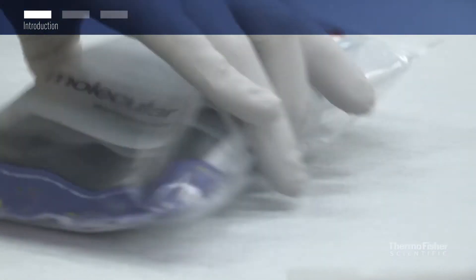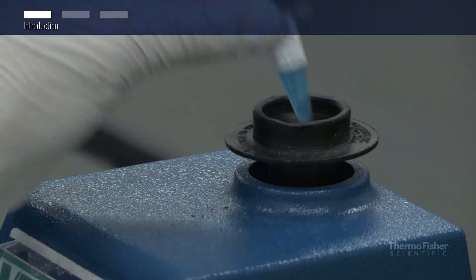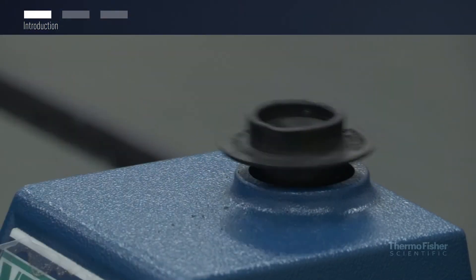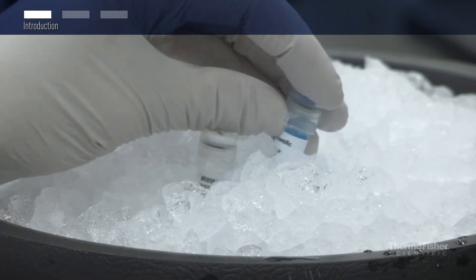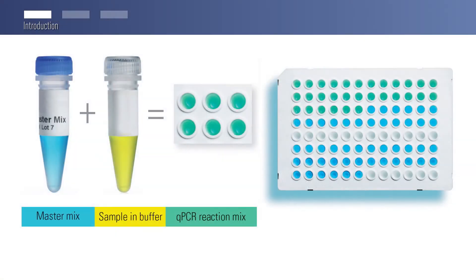Thermo Scientific Luminaris Color qPCR mastermixes provide a multi-level control for real-time PCR. In this video, we will show you how to control over pipetting errors. When preparing many reactions for real-time PCR, one common frustration is losing track of pipetting reagents and samples into the wells of the reaction plate. Our blue qPCR mastermix and yellow sample buffer prevent this frustration.